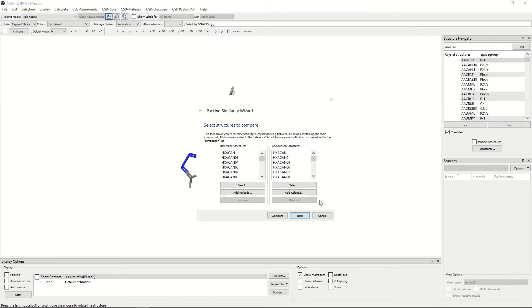If at this point you would like to compare the two with the default settings, you can click compare. However, today we will click next.